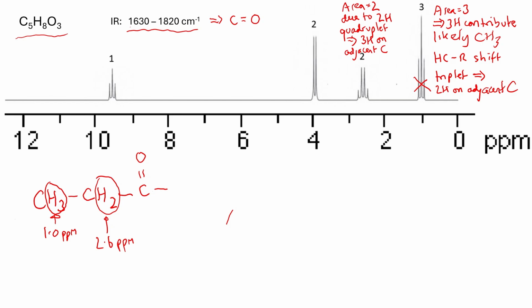So we say that this has an HCCO shift because it's in that 2 to 3 ppm region. Okay, so we've learned all of that from this peak. So now we cross it off and say, right, don't look at that peak anymore. The remaining hydrogens in the structure must just come from these other 2 peaks at around 4 and around 9 and a bit ppm.